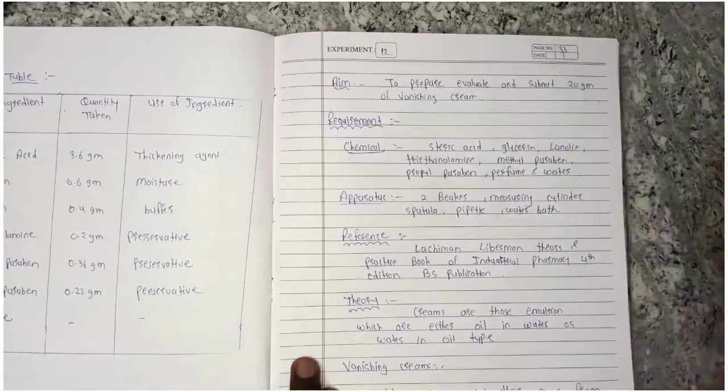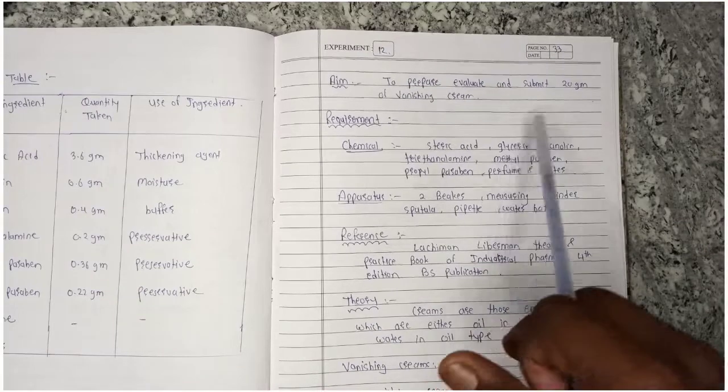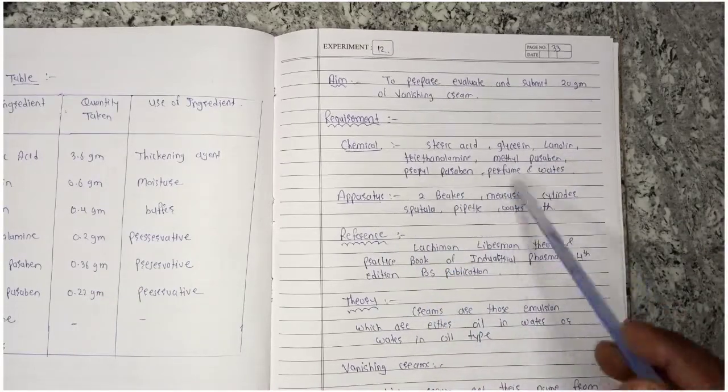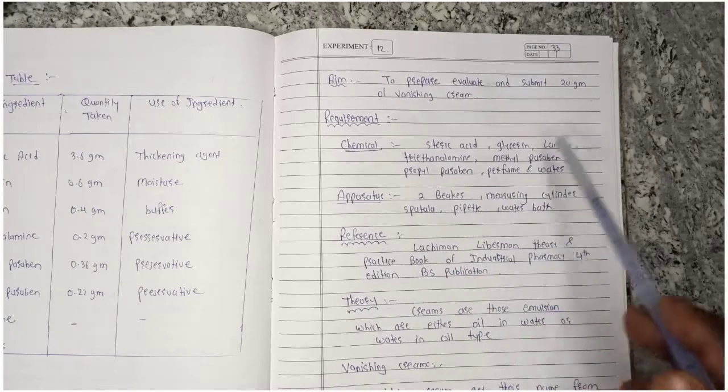The chemicals needed are: steric acid, glycerin, lanolin, triethanolamine, methylparaben, propylparaben, perfume, and water.